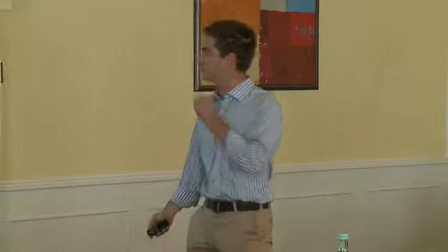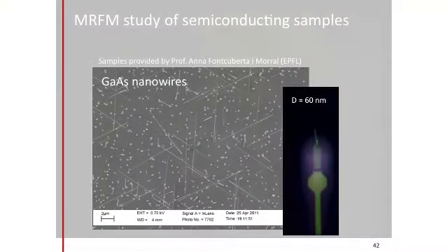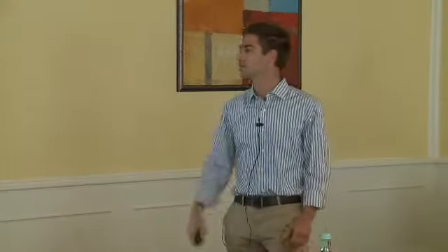So I'm getting signal that I should wrap up. I should just say that we have some plans to work on doing some more interesting sample imaging, namely imaging nanowires and other kinds of semiconductor nanostructures. And this is just a picture of one of our latest efforts in putting a single nanowire on the end of the lever in order to map its gallium and arsenic density. Okay, so with that, I think I'll skip all of this other stuff and thank the students who did all this work and the funding agencies for the support.